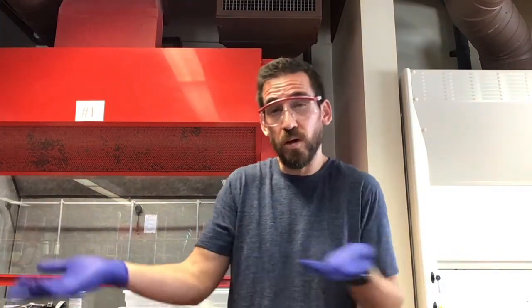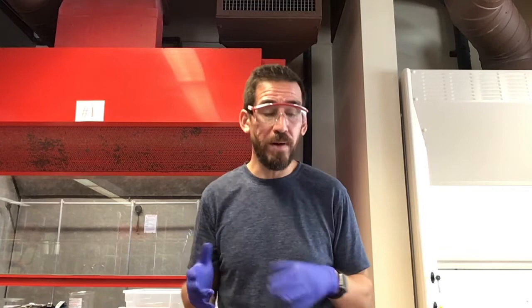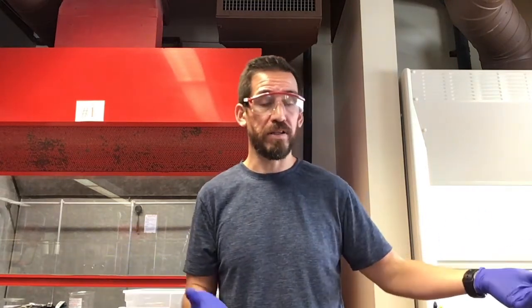Because this is an Sn1 reaction, water is a polar protic solvent, so it's not going to be the end of the world if we have a little bit in there. Silver chloride or bromide are still going to precipitate perfectly fine in water, so it shouldn't affect the rate of the reaction. Yada yada yada. Okay.